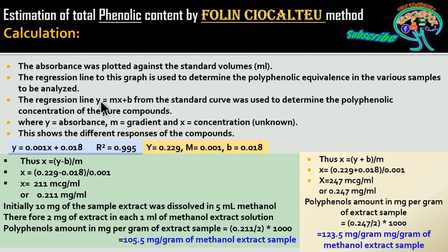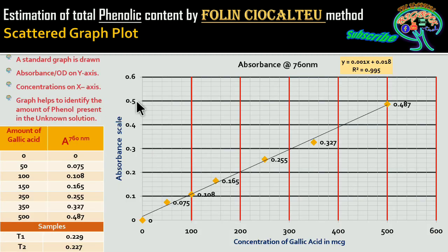Now you see that y is equal to mx plus b. This is the value we got after developing the trend line or linear regression line.